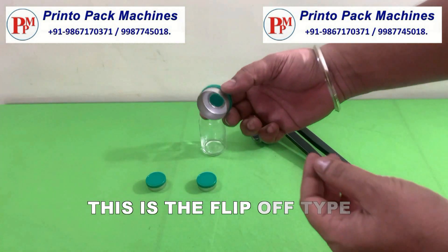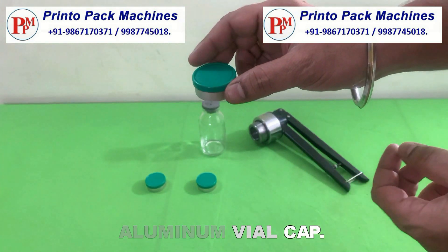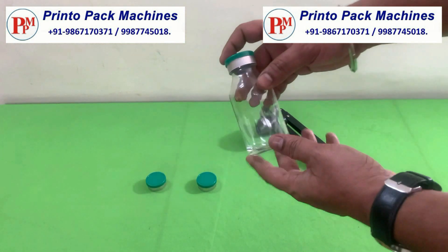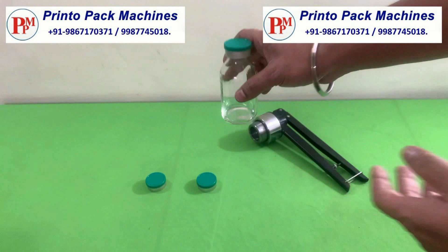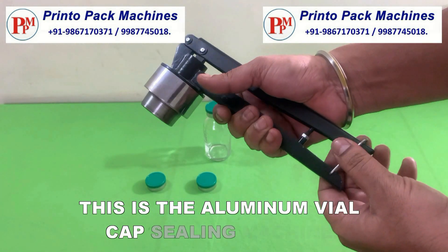This is the flip-off type aluminum vial cap. This is the aluminum vial cap sealing machine.